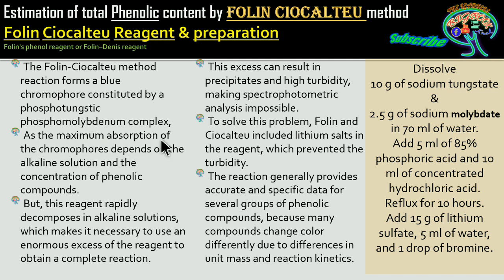The maximum absorption of the chromophore depends on the alkaline solution and the concentration of the phenolic compounds. So here, as you are observing, this reaction will take place in the presence of the alkaline solution. Depending upon the phenolic compound concentration, the amount of absorption is going to increase. But this reagent rapidly decomposes in alkaline solutions, which makes it necessary to use an enormous excess of the reagent to obtain a complete reaction.